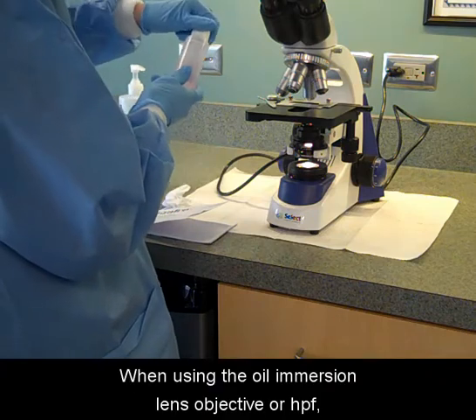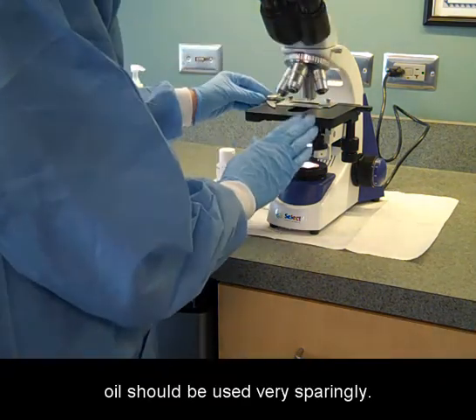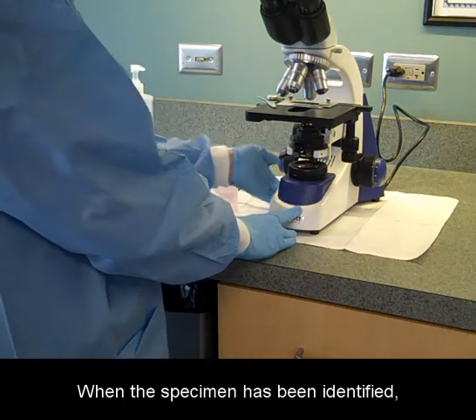When using the oil immersion lens objective, or HPF, oil should be used very sparingly. When the specimen has been identified, turn off the light and return all items to the proper storage area.